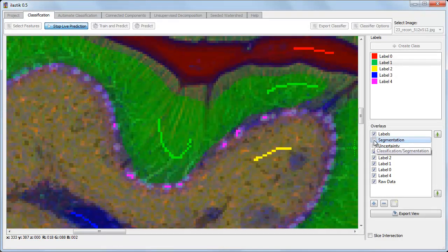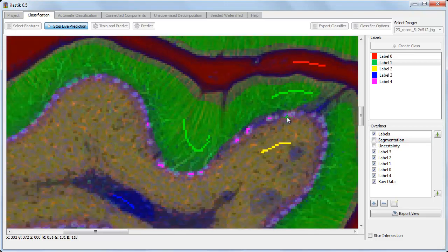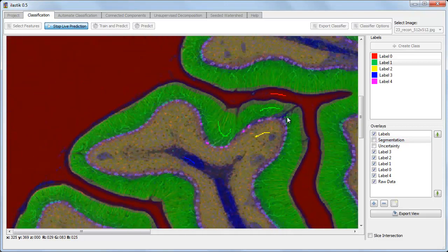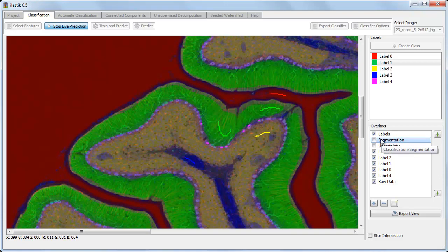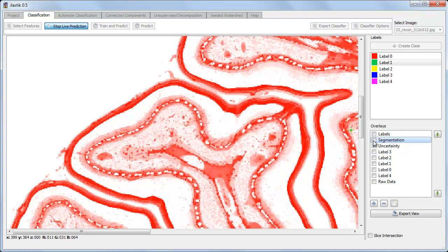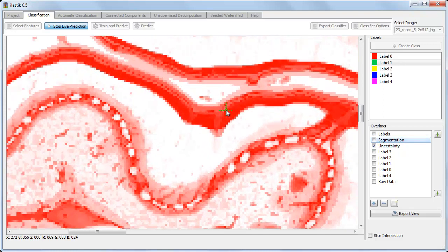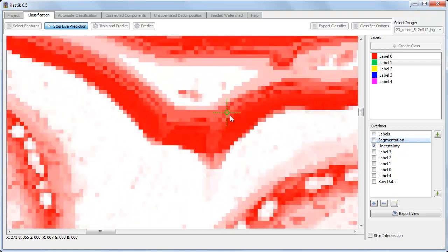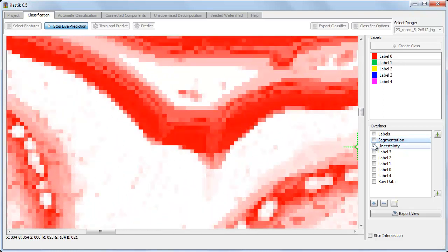Now let's zoom out and look for areas where the classifier is still uncertain. We can invert the visible overlays by hitting the space bar. And now the red regions are where the classifier is most uncertain. Let's zoom in on one of these regions and provide it with some more labels to improve its predictions.